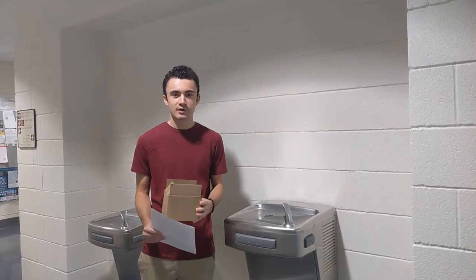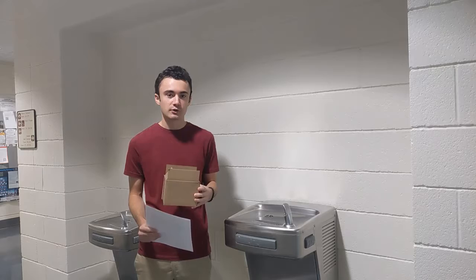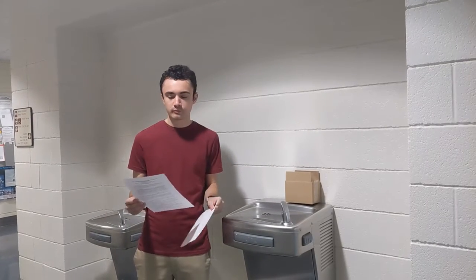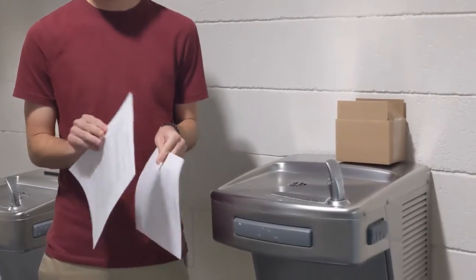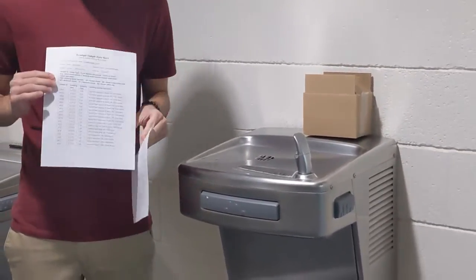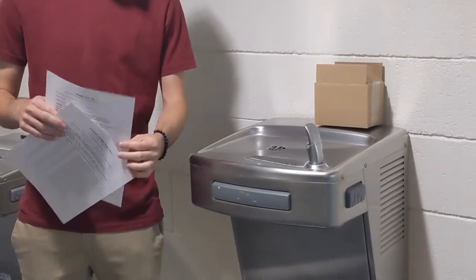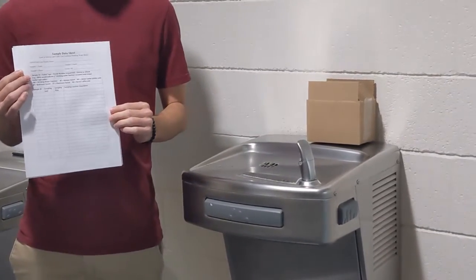Each school will receive a box containing a number of kits, one corresponding to each sample location. Within the box, though, there will be two pieces of paper, one containing the instructions for sampling, and on the flip side, it contains an example for the sample data sheet. The other paper is the sample data sheet itself, which will be filled out for each sample location.